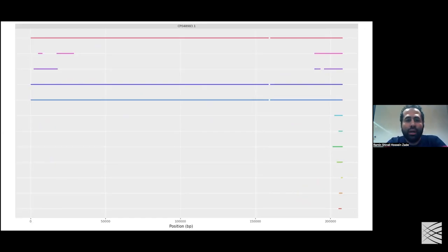There is also another figure that tries to show which location each cluster is covering again. But it also includes the smaller clusters that were not included in the previous figure, and you can see the same problem that I mentioned earlier. There are regions where there are more clusters than the actual haplotypes. So what should we do with these two extra ones and with these little ones? Should we just ignore them?